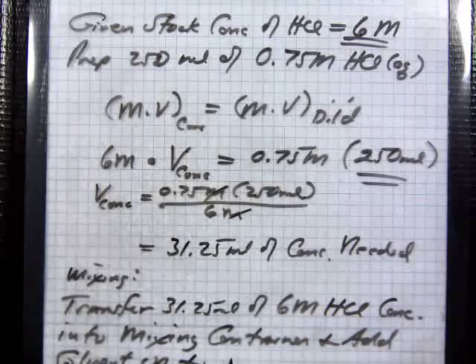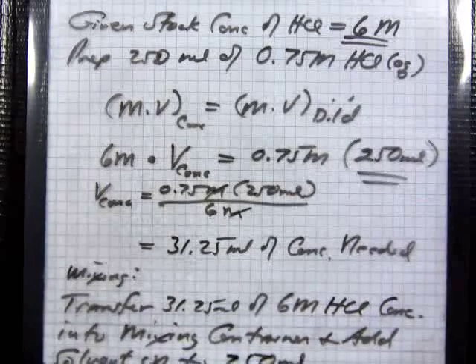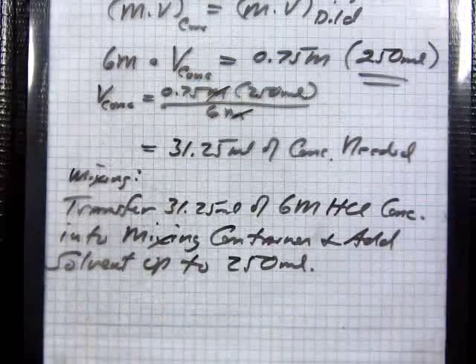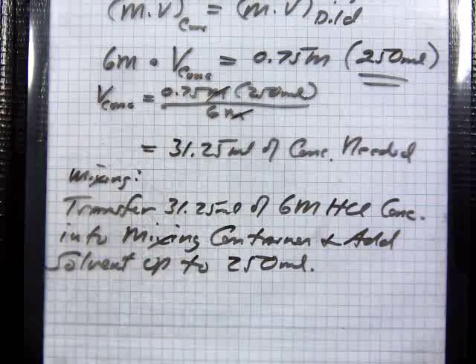What did I say? 250 mils, yeah. Total volume. Move it up so you can see. So it's just showing you the protocol and mixing that.